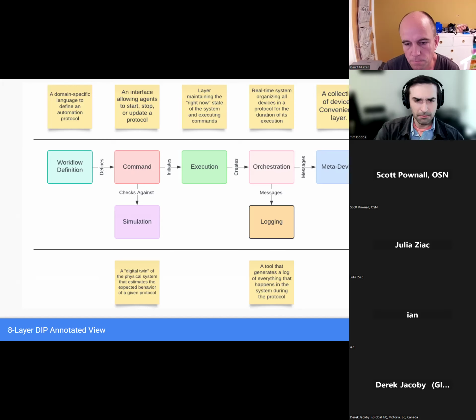Composability is especially great because you want to be able to define some fundamental primitive, let's just say aspirate, so pull up a liquid. Then you could compose it and say a distribution across a row is when I aspirate a certain amount and then distribute an equal amount of liquid all the way across those rows. So I can combine different methods.